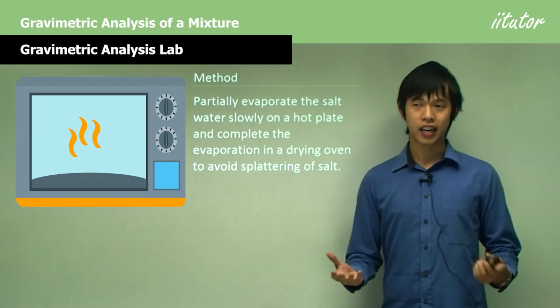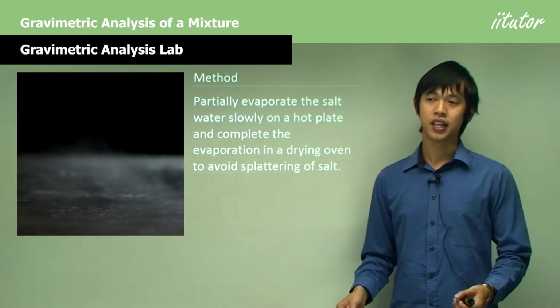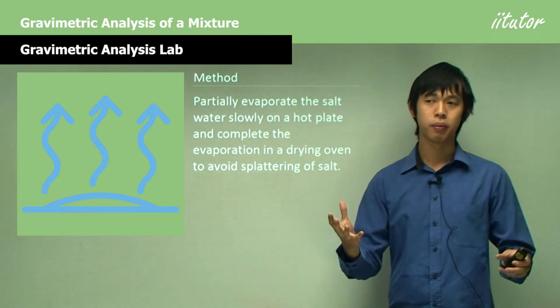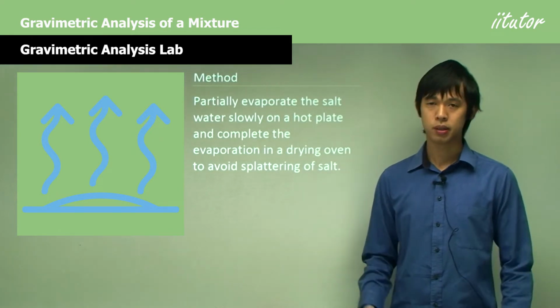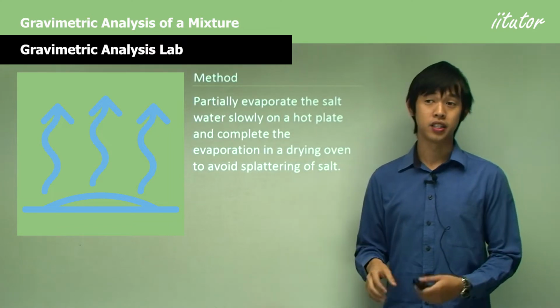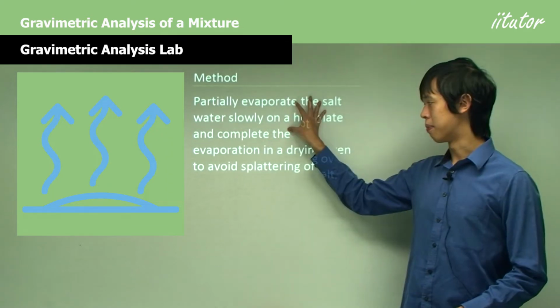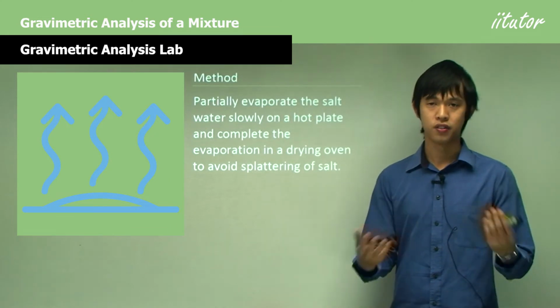You know, on a hot day, if you spill some water on the ground, it doesn't sizzle or boil, assuming it's not that hot. It kind of just gently disappears over time. Similar here, we went in the drying oven, we've got kind of hot environment, but it's not so hot that things will sizzle away, it'll just disappear on its own accord, similar to a hot day and you spilled water on the floor. With the hot plate, it's like if you pour water into a really hot pan, it's just gonna boil instantaneously and splatter and go everywhere. So this is just to get it high temperature without boiling, and then the drying oven is just to get rid of the water over time.